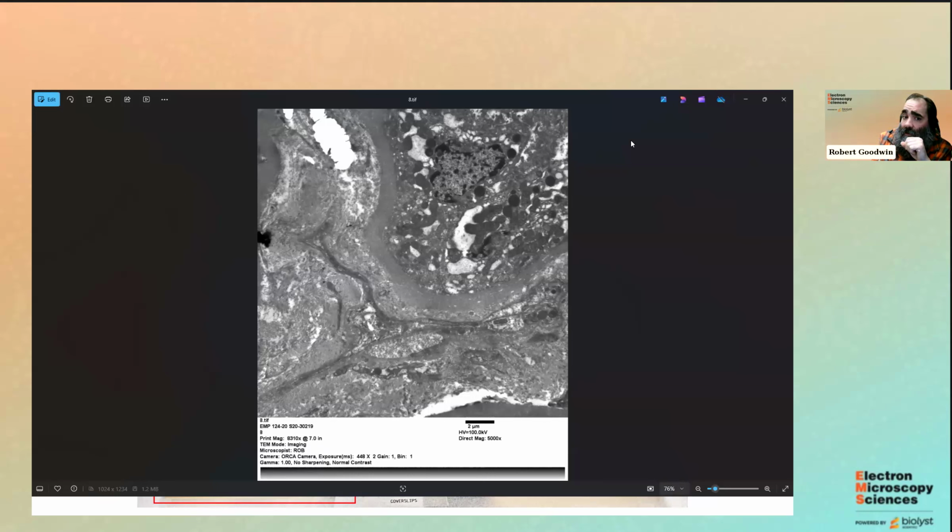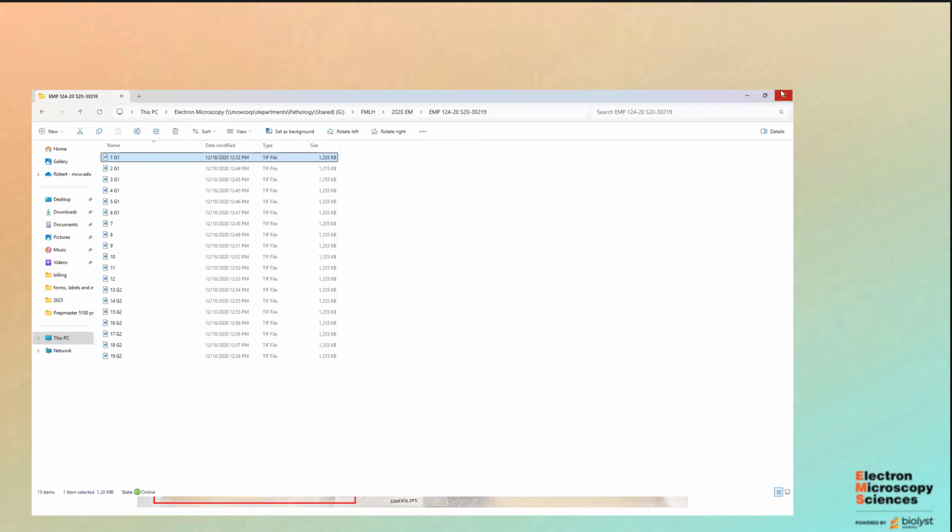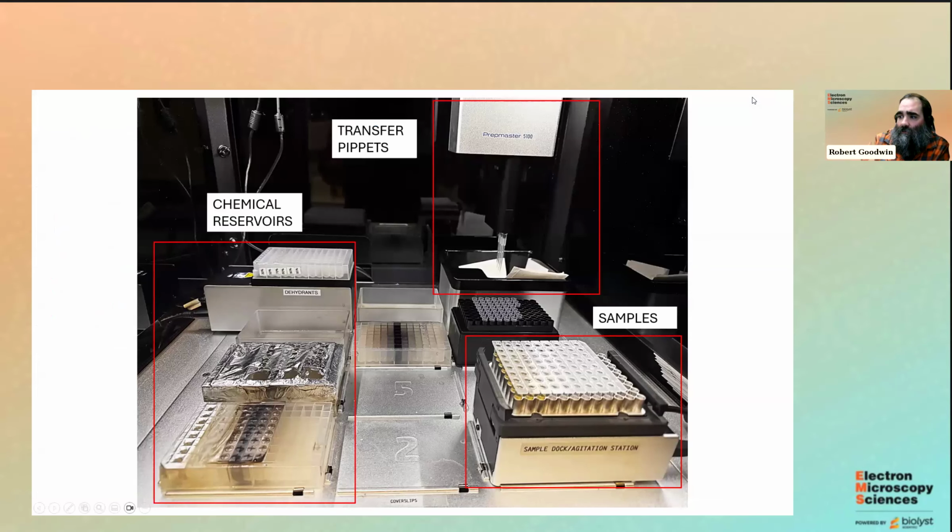We haven't seen any issues with contrast or any degradation of the tissue, because that was my biggest concern. I was very skeptical at first when Tom said you can process these things really quickly. We've only got it in osmium for 20 minutes, I'm not going to have the contrast, or it's moving through the dehydration phase really quickly, so how is it going to embed very well?